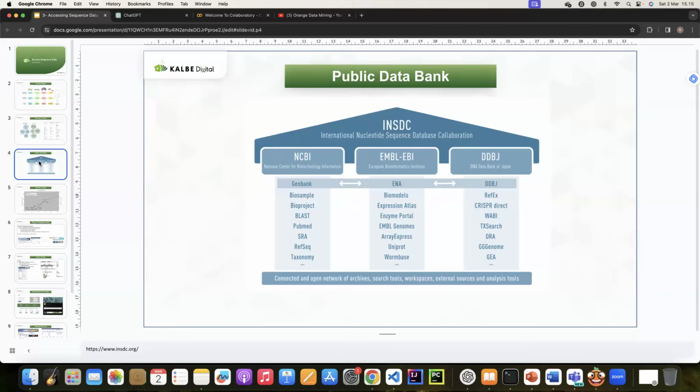So collecting new data for genomics is quite expensive. So for example, you take the data from saliva and blood and then go to BRIN, our research agency in Indonesia. They have many next generation sequencing devices there. You pay the operator there to make sure you get the data. You get the data like FASTQ file or SAM or BAM.